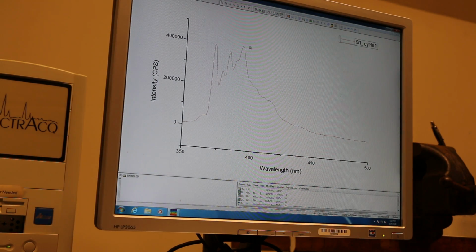Most large molecules of that size, say about 4 or 500 Daltons, something like that, don't have sharp lines like that. But pyrene and other polycyclic aromatic hydrocarbons do. And in RadLab, I use this instrument as well, and I let them take spectra of pyrene. And those sharp peaks correspond to vibrational energy levels. It turns out that in quantum mechanics, not only are electronic emissions governed by quantum mechanics, but so are vibrations and rotations. And those sharp peaks at about 370 to 410 nanometers represent vibrational states of the molecule.